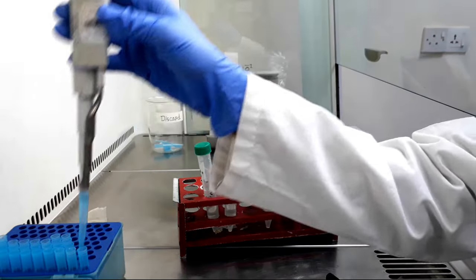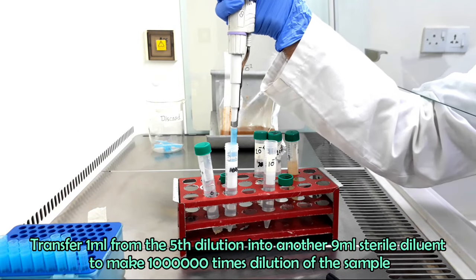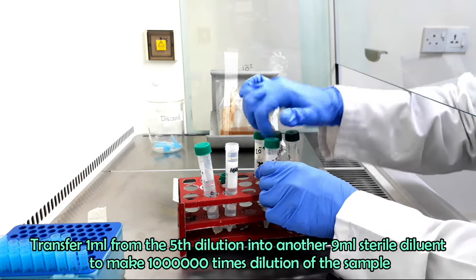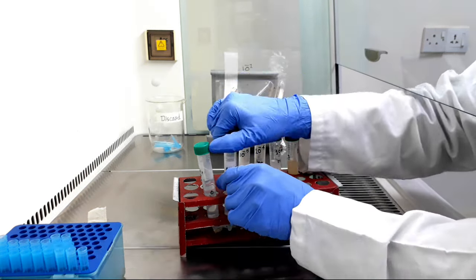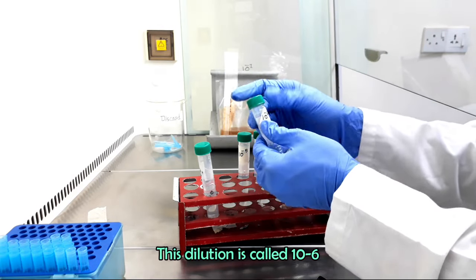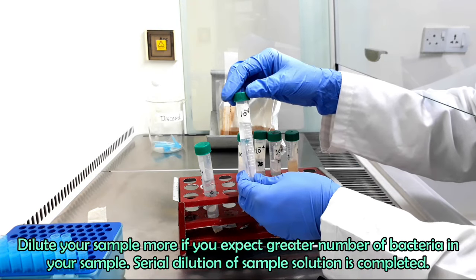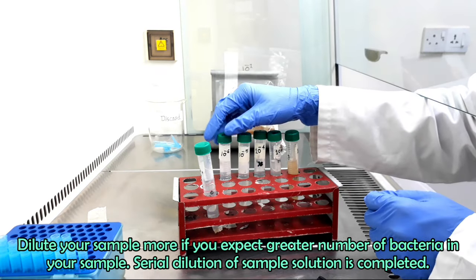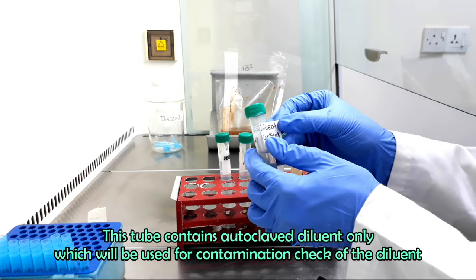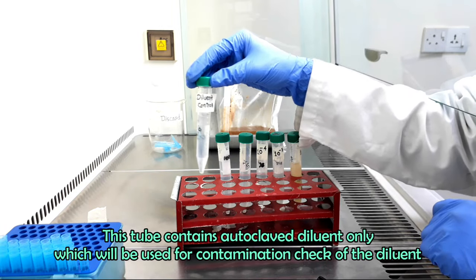Again, transfer 1 ml of the fifth dilution into another 9 ml sterile diluent to make 10 lakh times dilution of the sample. This dilution is called 10 inverse 6. Vortex the sixth dilution. Dilute your sample more if you expect a greater number of yeast and mold in your sample.